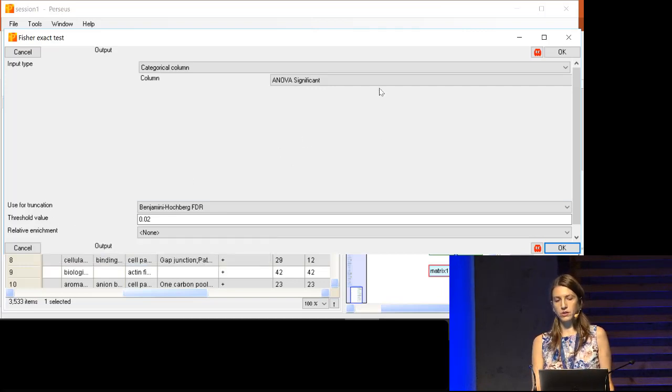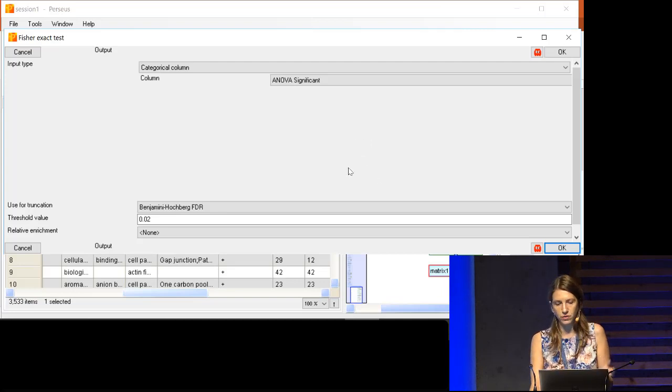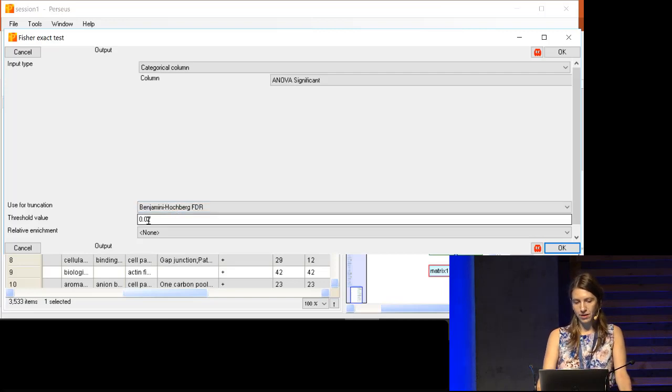Here again, because essentially we'll be checking if any of our pathways or any of our biological process is enriched, it means that we'll be doing really many statistical tests. And we have the same problem that we'll again try to compute p-values, and some of those will be significant by chance. So we again need to control for this false discovery rate. In this case, it would be super difficult to do permutation-based FDR, so we stick to the Benjamini-Hochberg FDR.